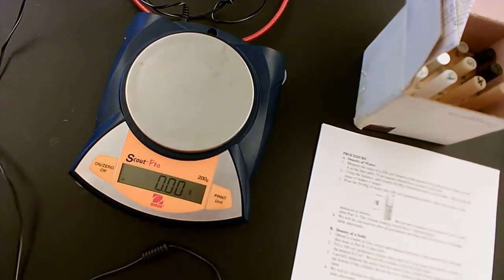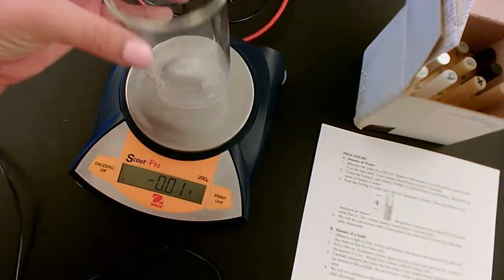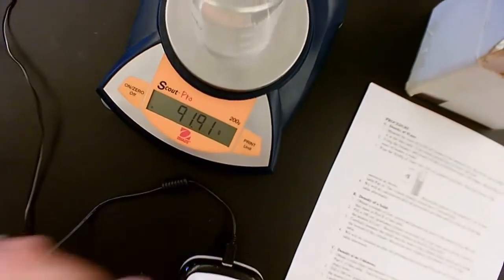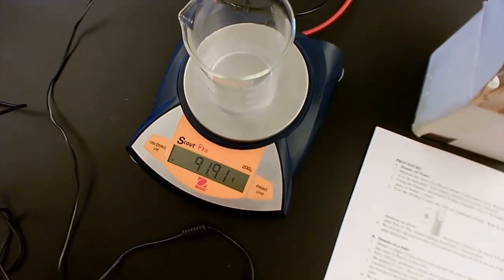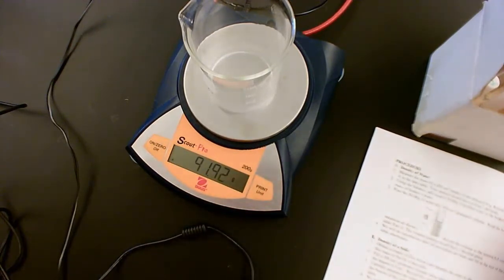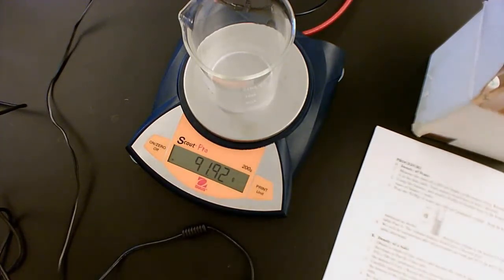It says measure the mass of a 250 milliliter beaker. Here's our beaker. We're putting it on the scale, and you should record the mass of your beaker exactly as shown on the balance. So make sure you record that mass in your data table. This is the mass of your beaker. Now it says to add exactly 50 grams of water.